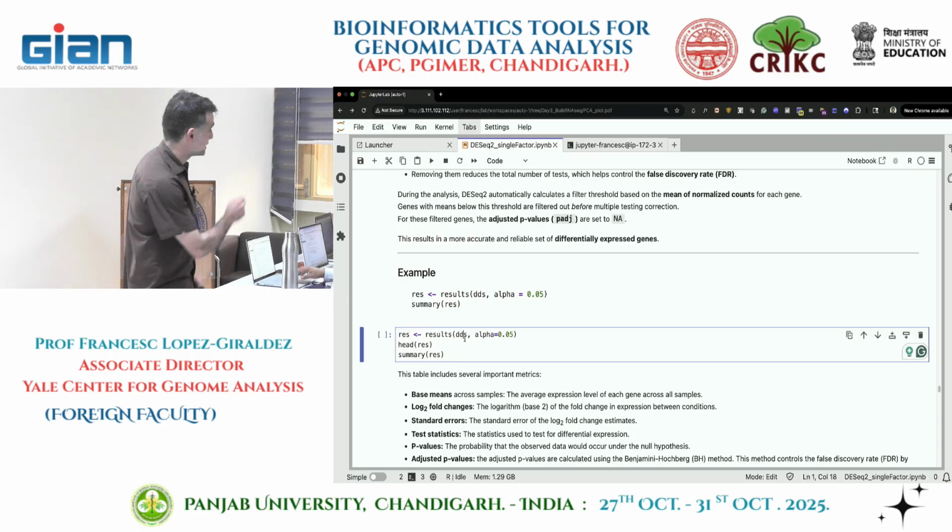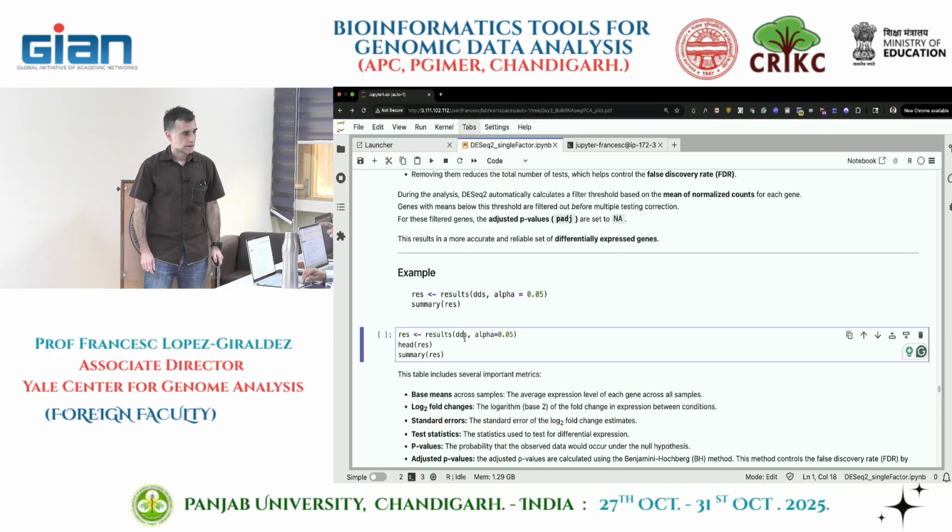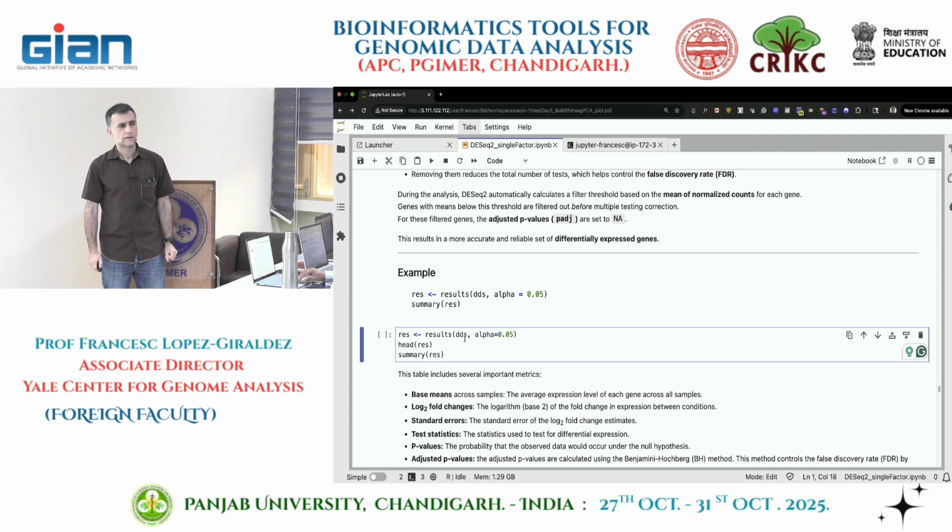So changing the 0.05 changes the way that the independent filter works. Ideally we should remove these genes if the false discovery rate is less than 0.05? No, you don't have to remove that. If we are doing it manually, like here where we are giving the command, and the data shows a false discovery rate of less than 0.05, that is when it would be significant, right? That's your p-value, your adjusted value.